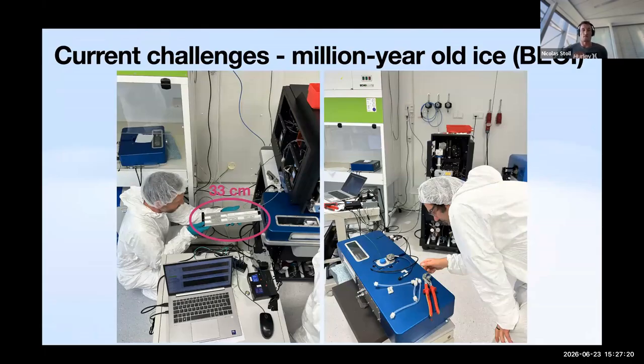And that's why we are working on a different idea of extending the length of the sample. So not going into higher resolution, but having larger samples, because for now, in general, for laser ablation, the area you were analyzing was usually a few millimeters square, maybe a centimeter times a centimeter, maybe a little bit more if you're lucky. And now Remy here on the right, an engineer, he's really pushing this by developing a new stage where you could put your samples in.